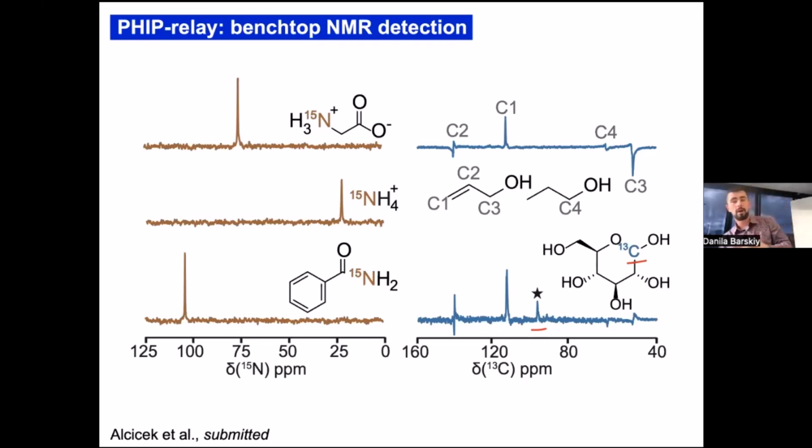And in terms of our research, what we're usually interested in is large polarizations, right? We are interested in sometimes just observing the phenomenon itself rather than employing the chemical shift distribution, which is available at high field. And I found that it's very nice to work in benchtop spectrometers. It's very simple. Certain things you observe just because it's faster, you can do the transfer much faster. Let's say manual transfer from Earth field to benchtop compared to manual transfer from Earth field to 800 megahertz, right? So only for these reasons. Otherwise, there are of course no fundamental reasons why you cannot use high field.